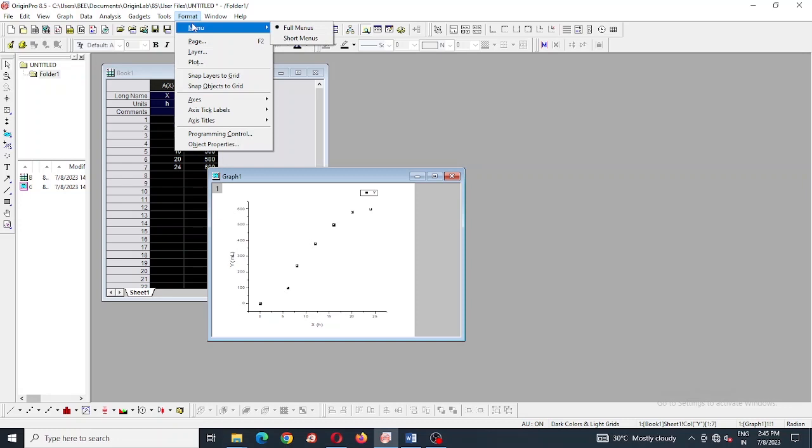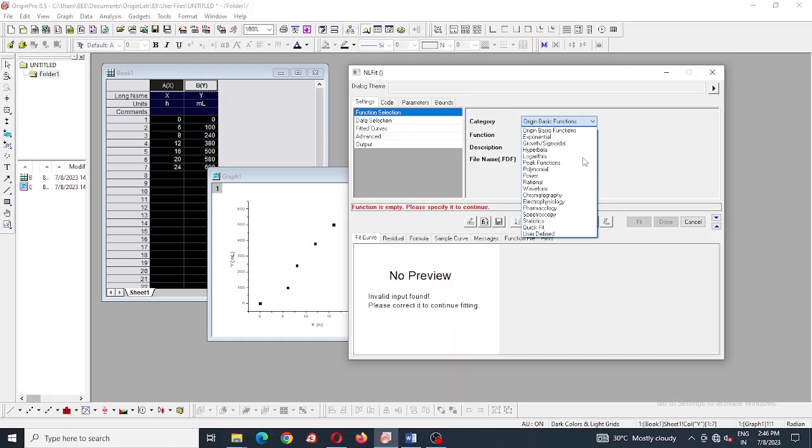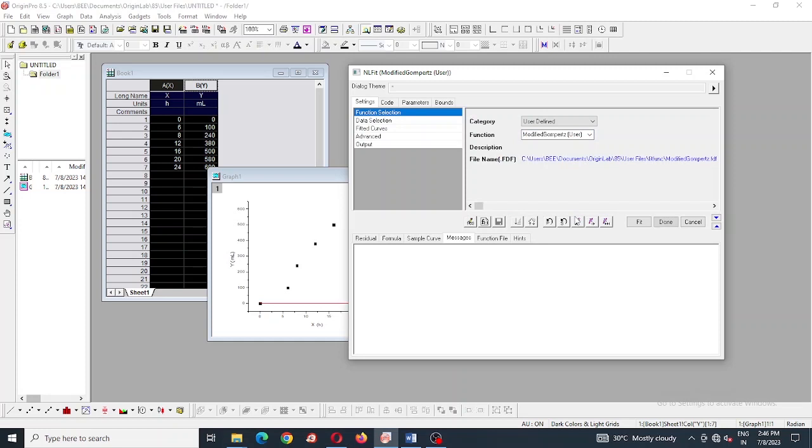So go to analysis, then fitting, and nonlinear curve fit. Next, user defined function, and select the function modified Gompertz equation, what you have created.